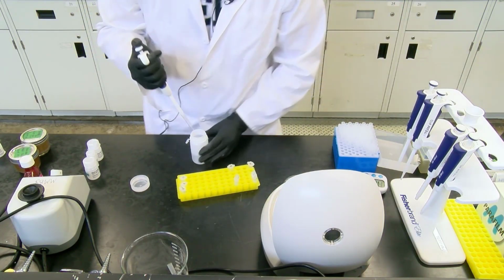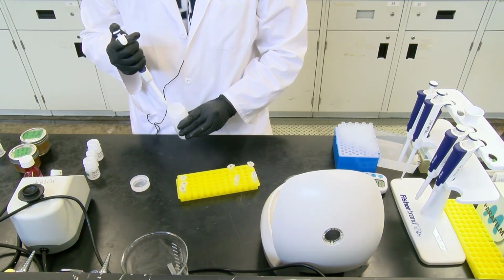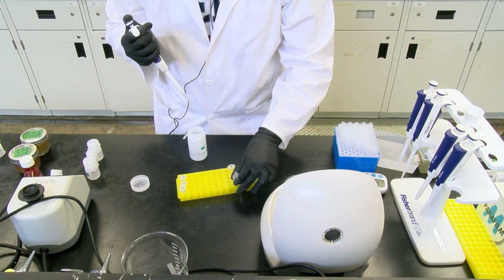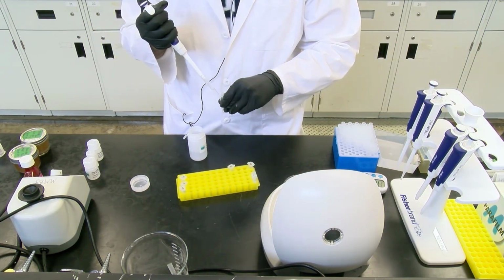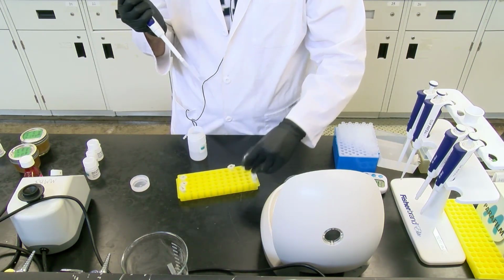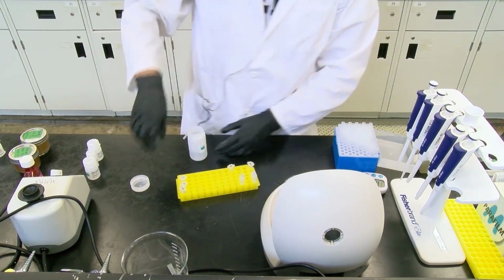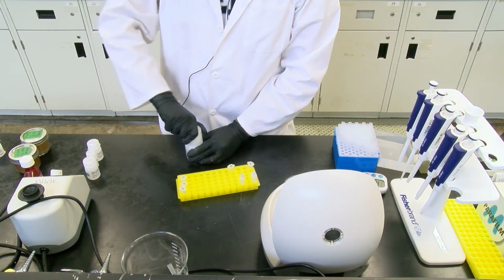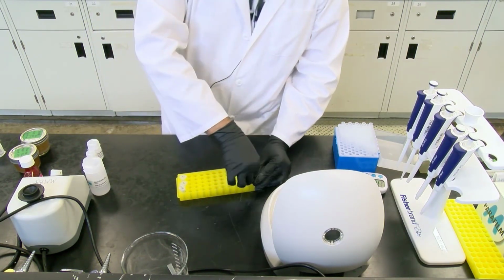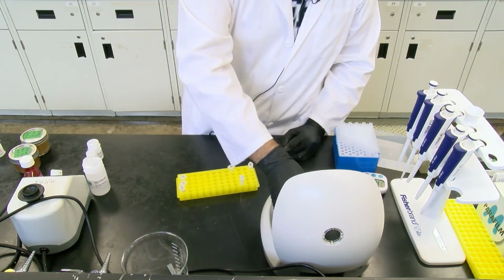Using the same buffer we used as the last step, using the PE buffer. So we're going to close this as we're done with it to the side, and we're going to run our columns one last time, last wash state.